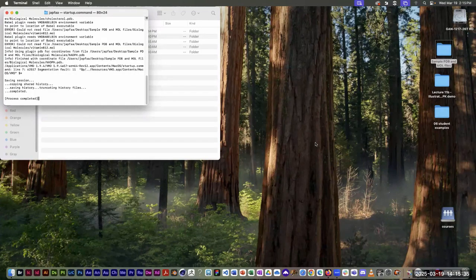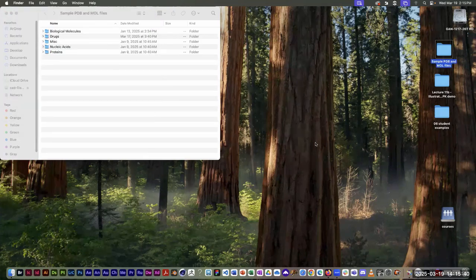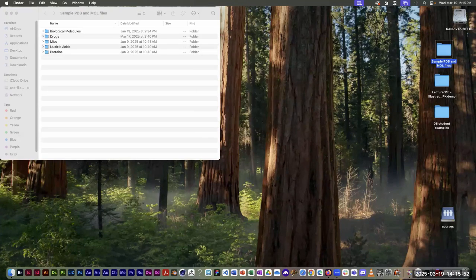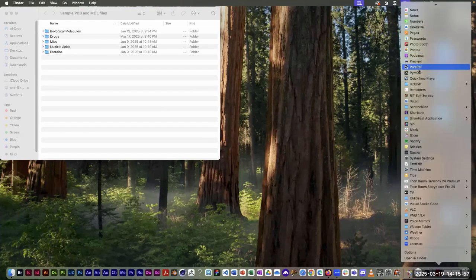I know people who actually like this application. It's produced at the University of Illinois. And so the folks at the University of Illinois at Chicago, their biomedical visualization program, they swear by it. But not sure why, because it doesn't ever seem to work for me. All right, so moving right along.